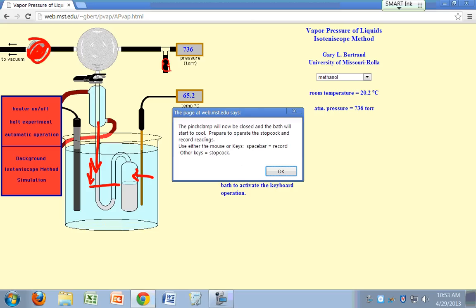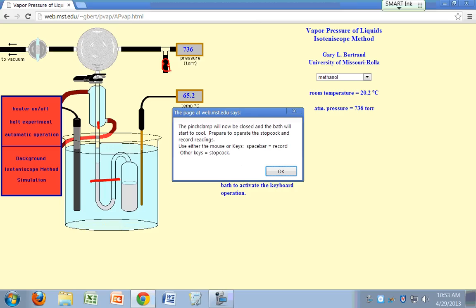You open up this stopcock to your pump by just pressing any key. If you hit the space bar, hit the space bar to record. So watch these liquid levels right here. Once they're matched, once your liquid levels are matched, then you hit the space bar to record it. The temperature, you'd be recording the temperature and the vapor pressure at that point. So let me illustrate that. I'm going to hit OK now.